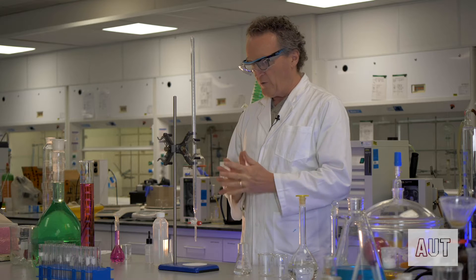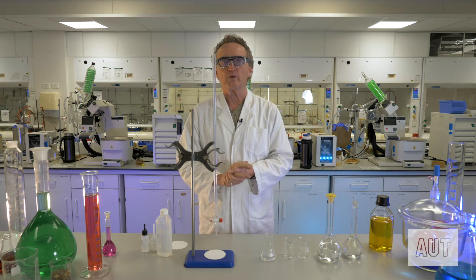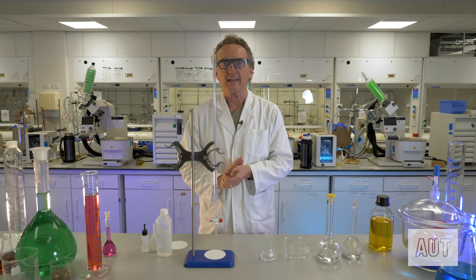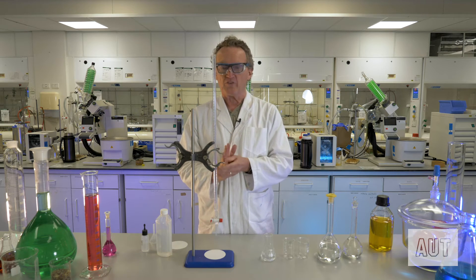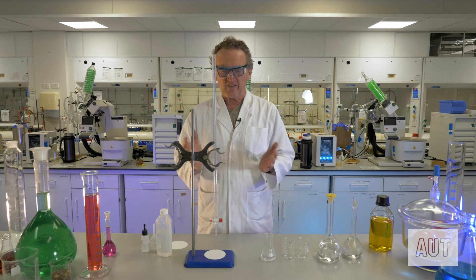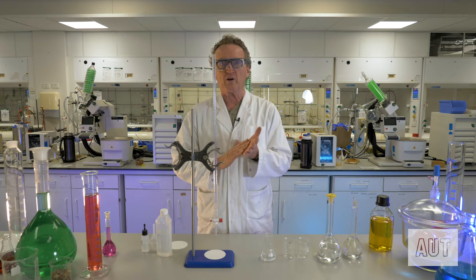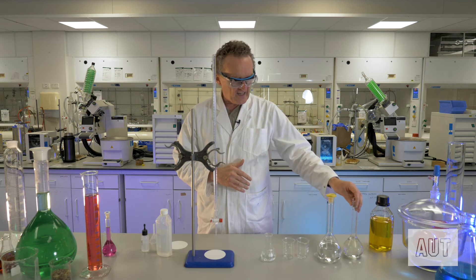Today we're going to do a classic acid-base titration. We are going to titrate hydrochloric acid against sodium hydroxide solution. In order to do a titration, the gear that you need is this — a burette — a very accurate and precise way of delivering particular volumes. And you need your solutions that you're going to titrate, obviously.